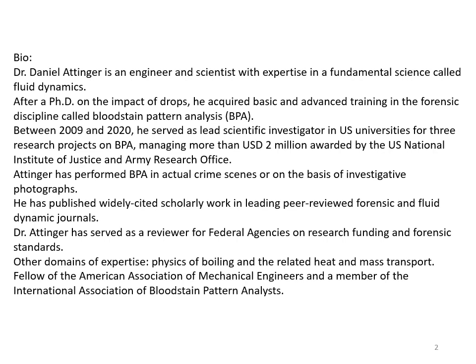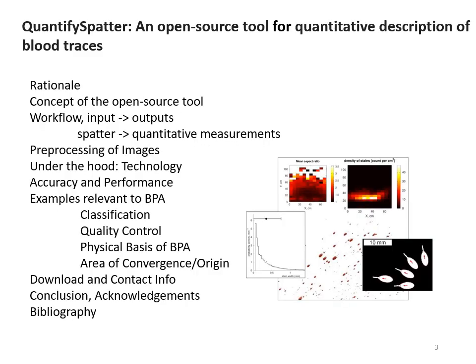So without further ado, this is what I want to discuss today. I'll tell you why I wrote this piece of software, why I wanted it to be open source, what it means to be open source, that everybody can look at it and use it for free. I'll show you the workflow, how the software works, so what you need to provide as an input and what you get as outputs.